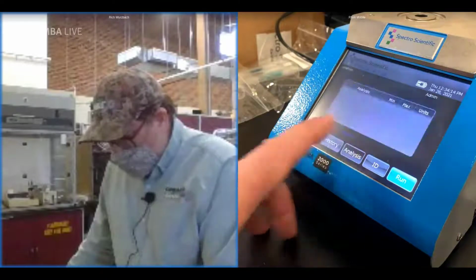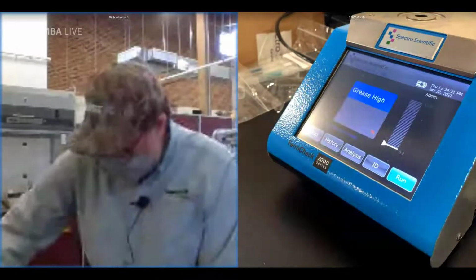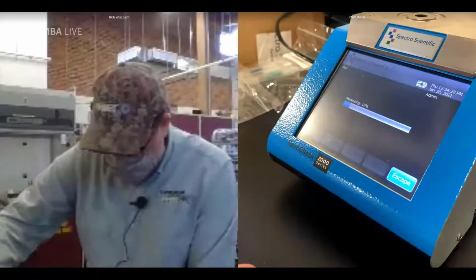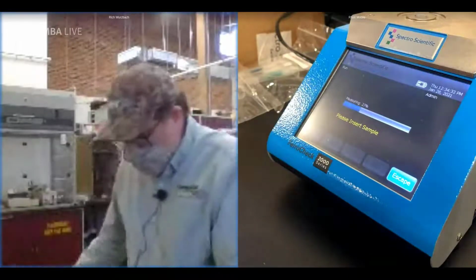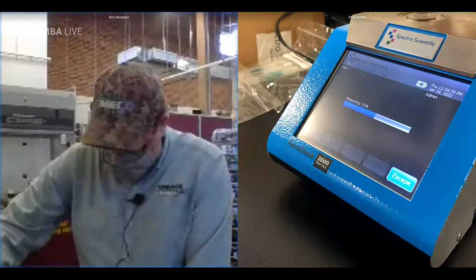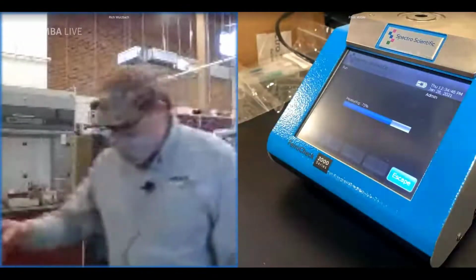Now let's see if I've got a higher concentration. I could switch that out, grease high, and start my process again, get my sample ready to go. Hit run, drop that in. And if your timing is off, it might stop and tell you to do it over again. So the timing is pretty important. You've got to be pretty attentive to get that right. Remove it at the right time, and then it'll give us a reading.